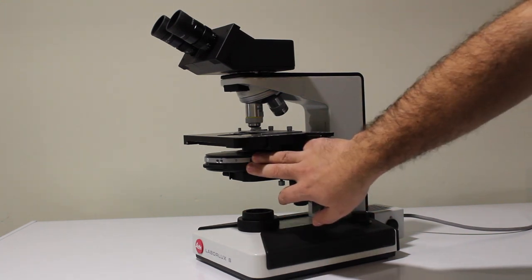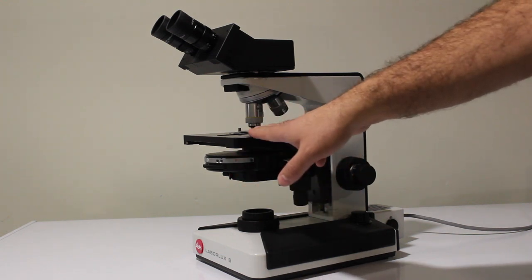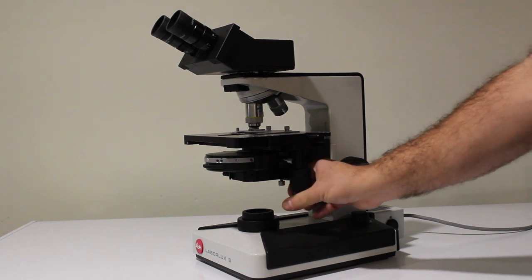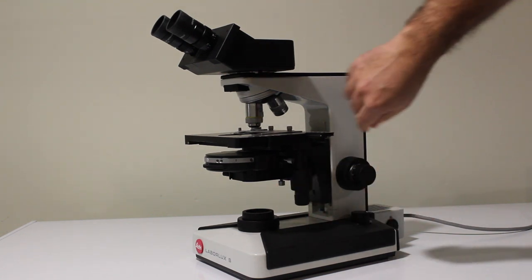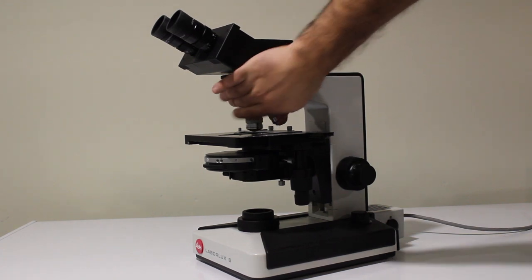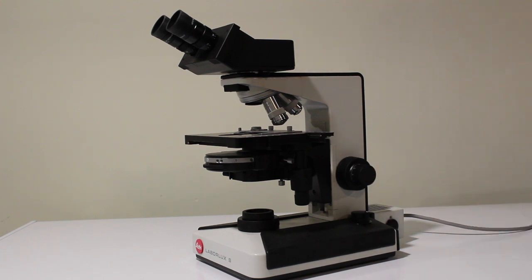Above that, we have the condenser, which focuses the light on the sample, the stage where you put your sample, and this is a mechanical stage, so it can be moved with these controls. We then have what is called the nose piece, which contains the different lenses that this microscope is equipped with. And that is essentially the major parts of the microscope.